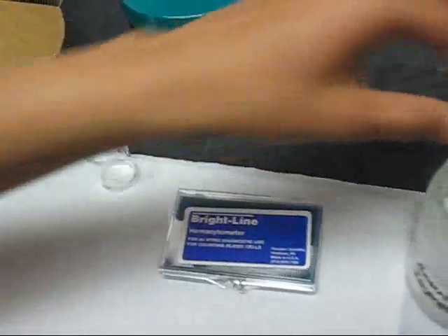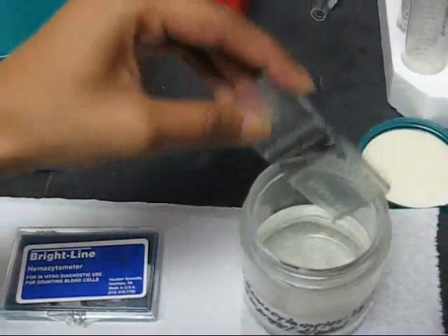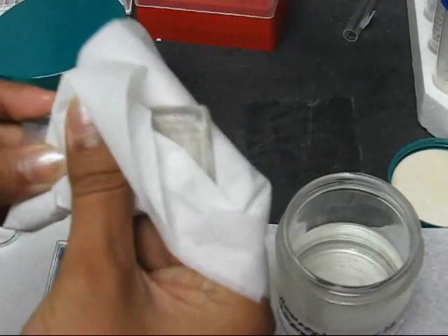The first thing you do is take out the hemocytometer and wipe it down with Kimwipes.